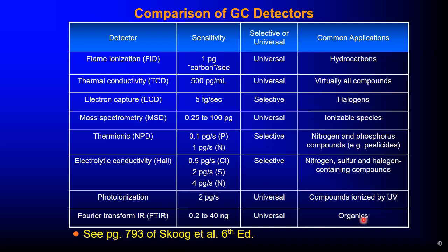So it means that you will really need to check on your detector and whatever you want to analyze, but majorly mass spectrometry for ionizable compounds, so you will know which one is good for you.